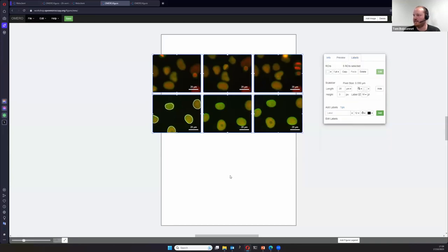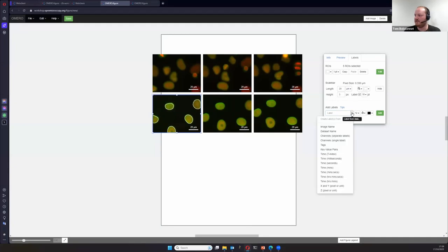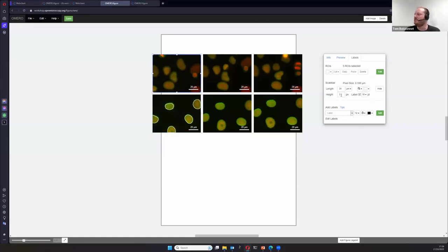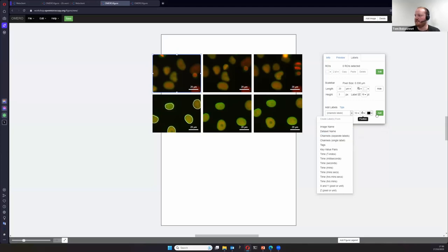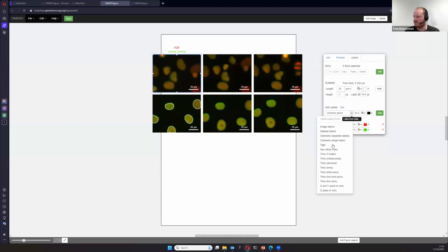In the Labels panel, if you want to add more labels to your images, there's a drop-down list of different labels you can attach that come from the metadata. If you select an image, you could show the name of the image, the dataset it comes from, or — like I did earlier — the channels as separate labels in color with the names of the active channels for the current panel.